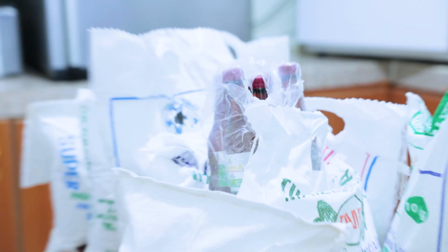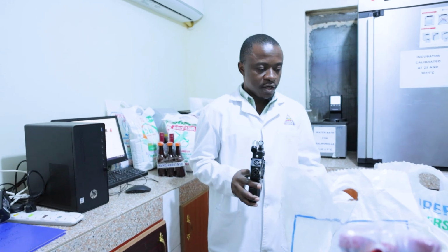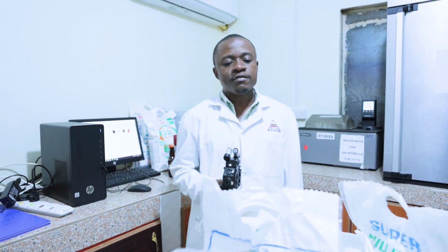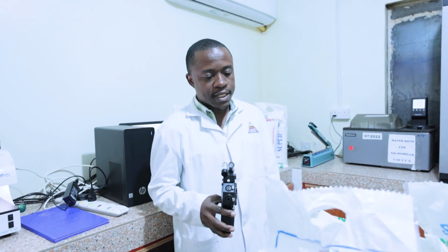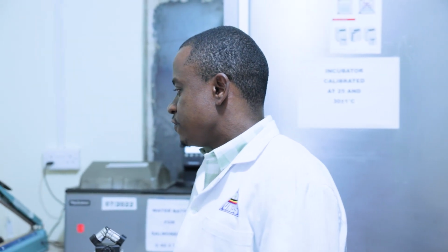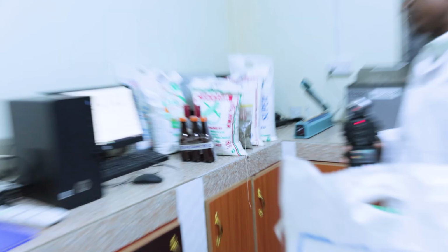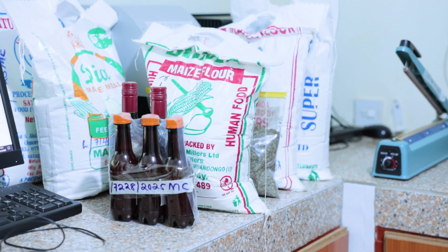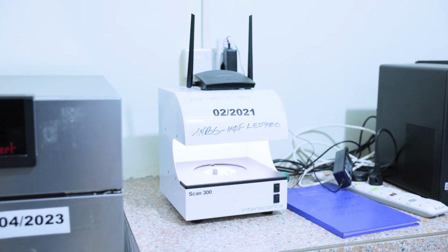Mainly we handle foods, because those are the most common samples we receive here. They are mainly food, but we also have other samples, especially maize flour and honey. We have fermented beverages, wine, and then animal feed. This region usually has most of such samples. So that's what we mostly handle from here. Unless you have any other question, but in simple terms, that's what we do.